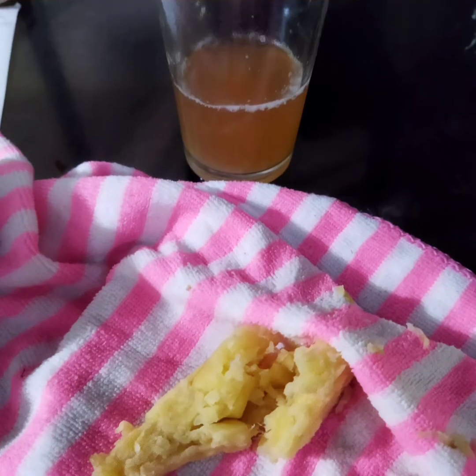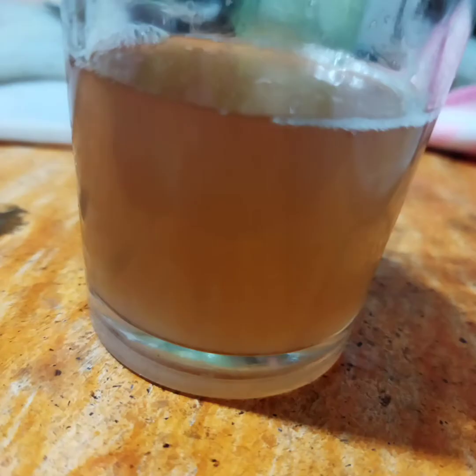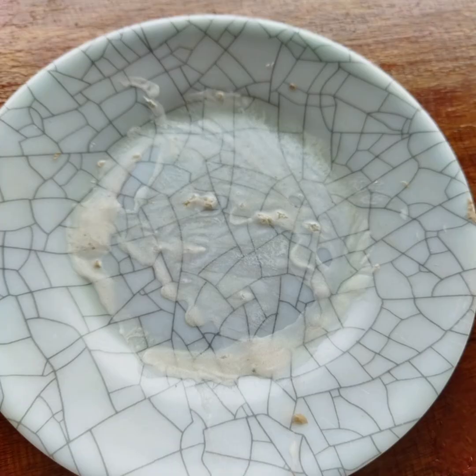Strain the mixture using cheesecloth or any fine cloth. Discard the residue and collect the filtrate. Allow the starch to settle at the bottom, then transfer it onto a small plate and air dry.